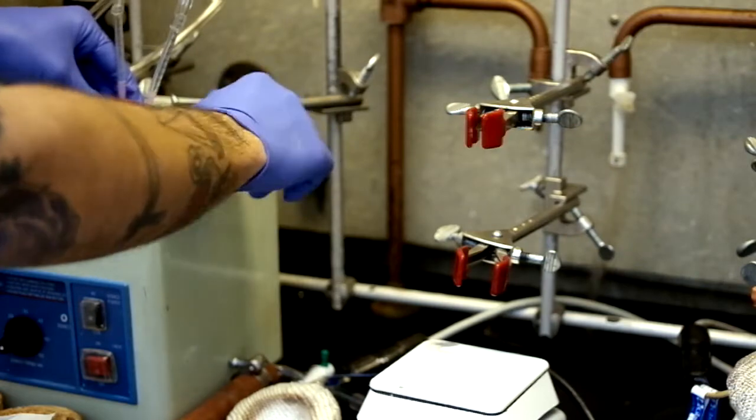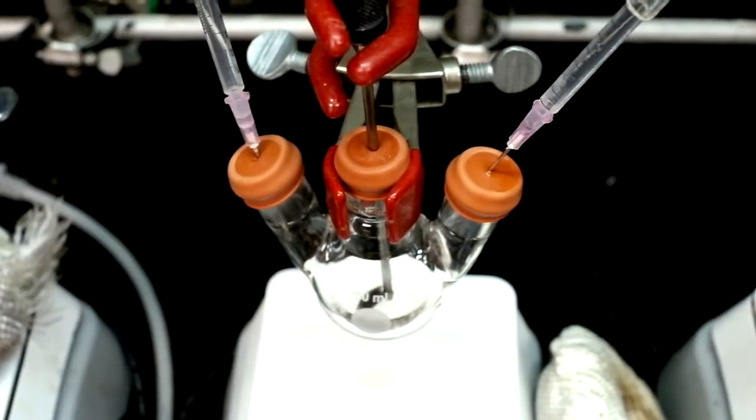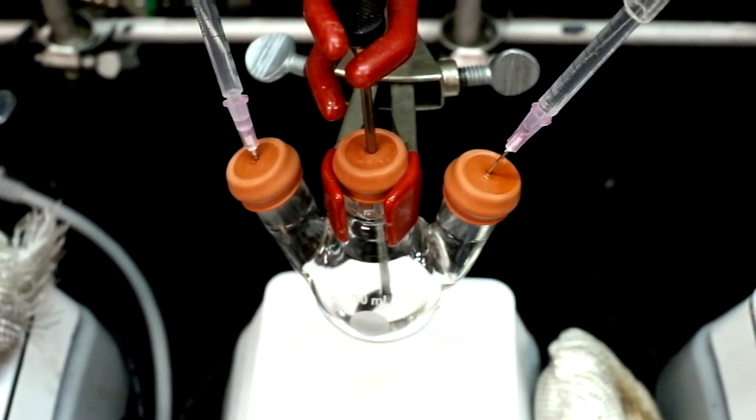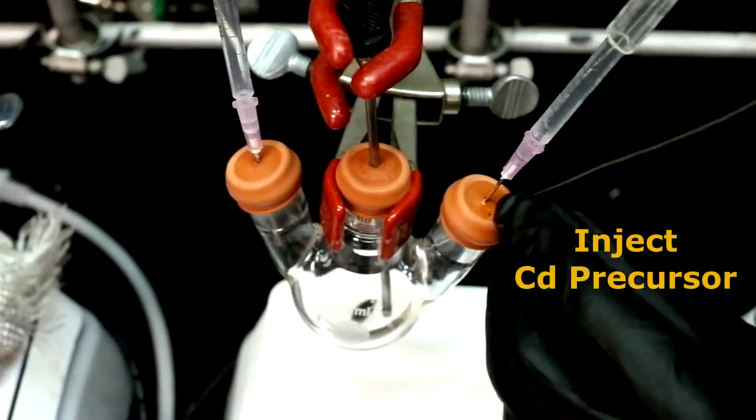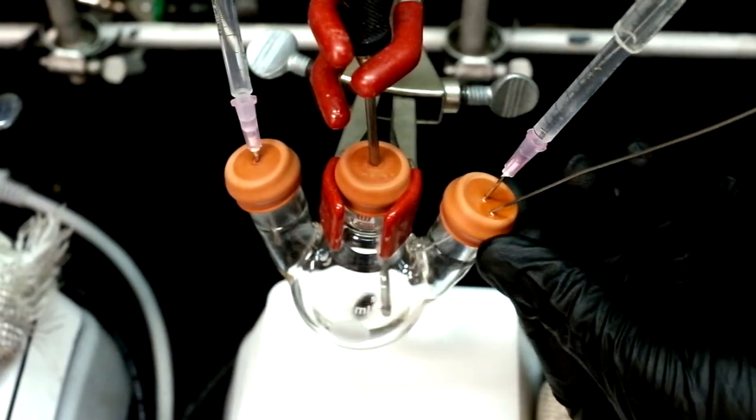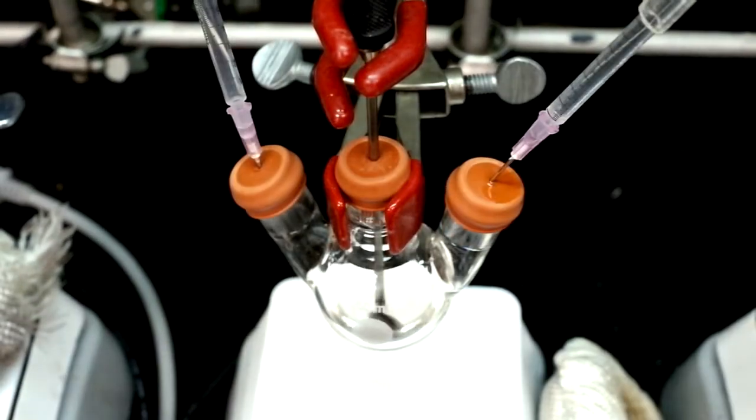Once the selenium solution has finished sonicating, it should be clear and there should be no powder left in the solution. At this point, we inject the room temperature cadmium solution into it. Set the flask aside and let the precursors mix.